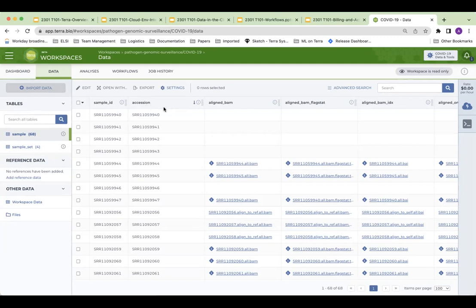So in a way, it's more freely structured, right? Yes, it's pretty flexibly structured. And is there a possibility of joining 2 tables into one? Joining 2 tables into one. I think in order to join 2 tables into one, you would have to just create a spreadsheet from scratch, copy paste them together, and then upload it.